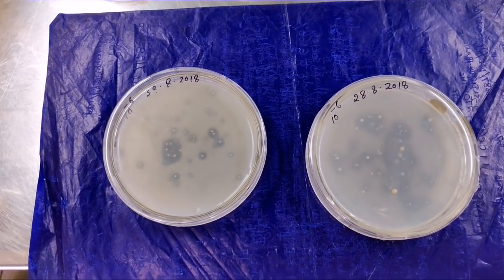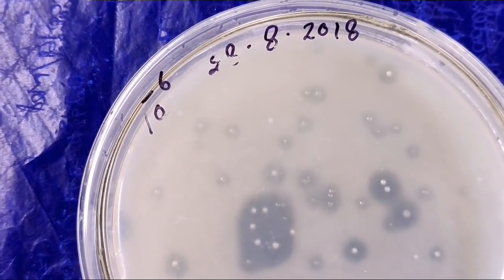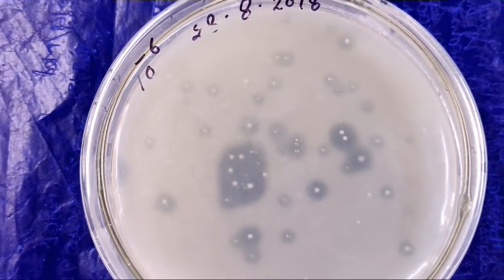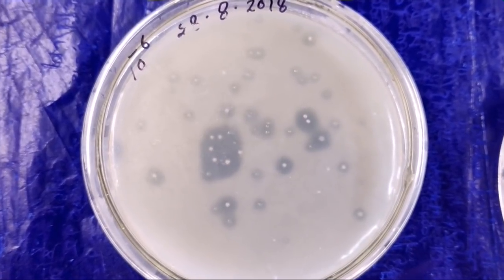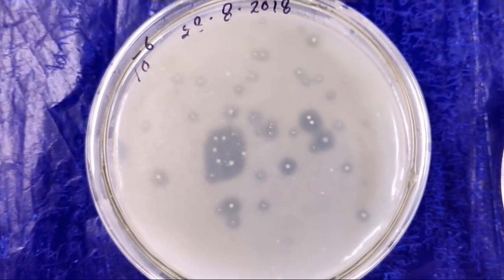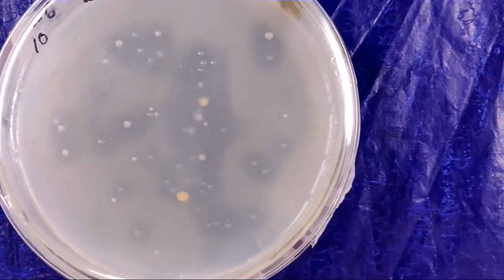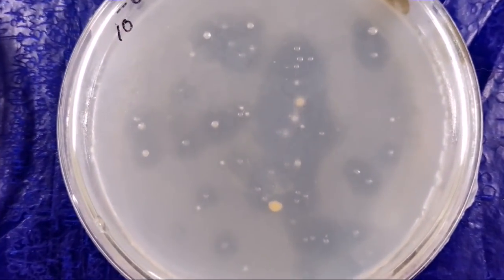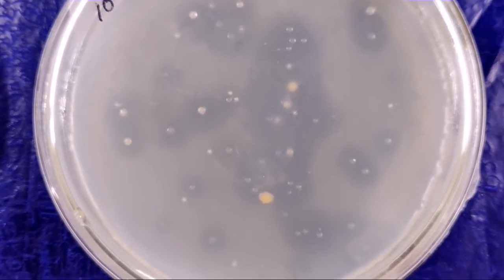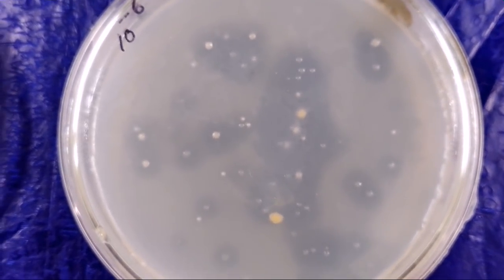You can see these plates. 1 ml has been put inside, and you can see small white dots — all are full of bacteria. It is present in crores. The characteristics of azotobacter bacteria — it makes a pigment and gives color. You can see the light brownish color. All these colonies are turning that color. That indicates this is the azotobacter, a very high efficiency bacteria.